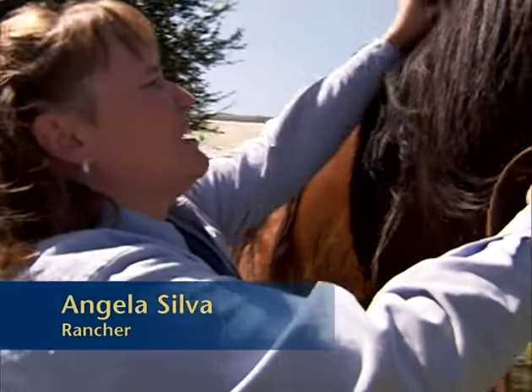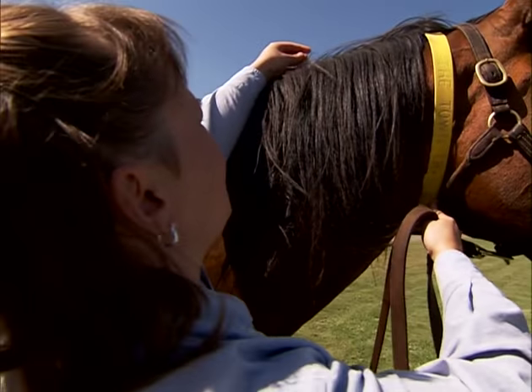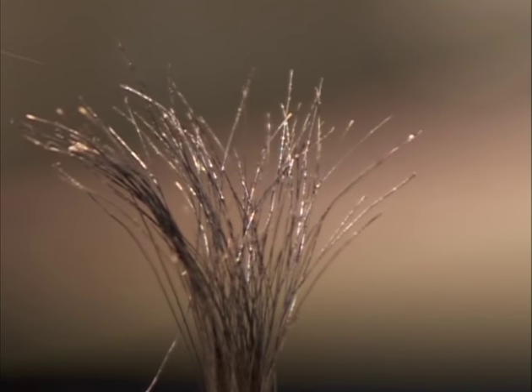I usually start out by pulling about 10 hairs at a time. You want to grab at the base, wrap it around your finger, and give a quick pull. You can see that you have very nice root follicles.